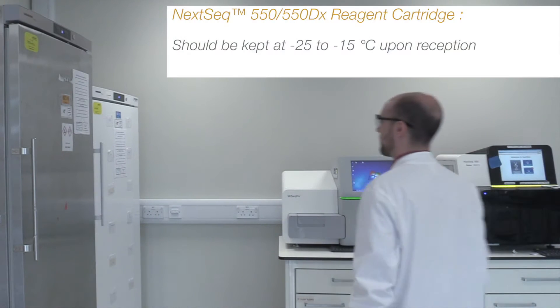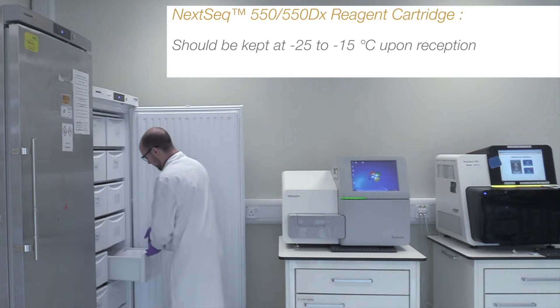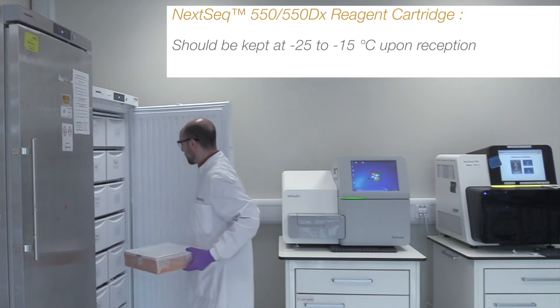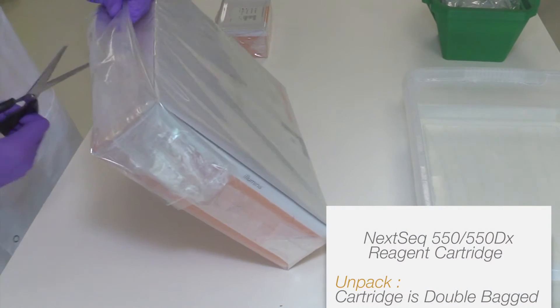These should be stored between minus 25 to minus 15 degrees Celsius before use. First, remove the reagent cartridge from the minus 25 to minus 15 degrees Celsius storage and unpack the box by removing the two layers of packaging containing it.